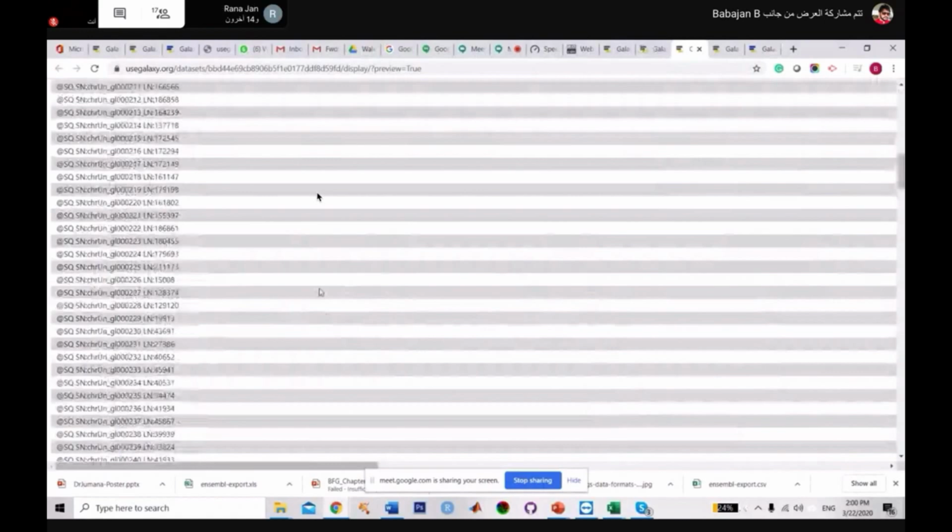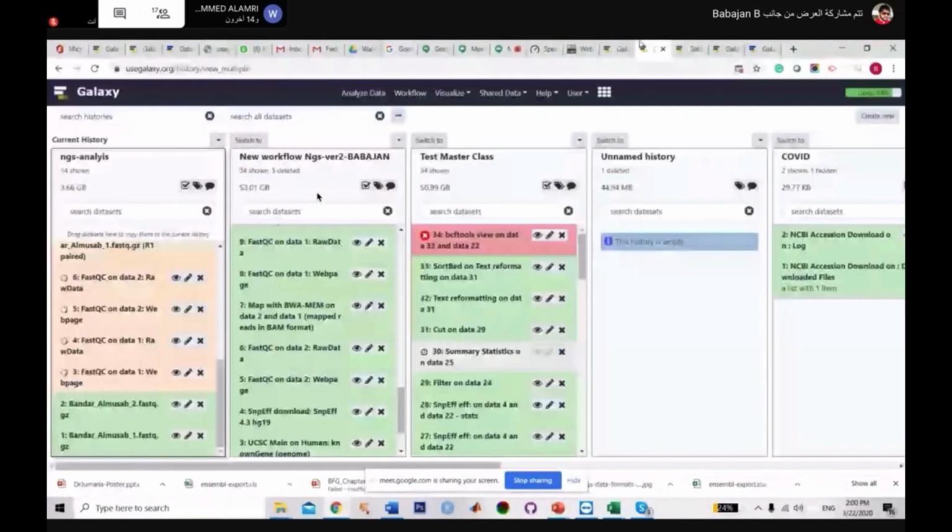It's going to take some time, at least 3 to 4 hours to align your sequence. Once you're done with the alignment, we need to do some more modifications, like removal of duplicate reads. We need to check the base quality, and filter the SAM or BAM file using various steps, and add different types of flags and stats. We need to convert the BAM file to a SAM file. Index statistics we just need to add.